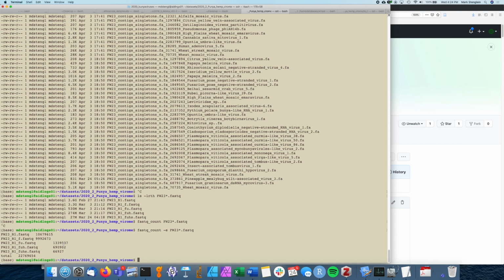After that step, we're only down to about 13% of the starting data set. So there's a lot of PCR duplicates. One thing that could have been done differently in making the library was to decrease the number of PCR cycles to try to get less duplication.